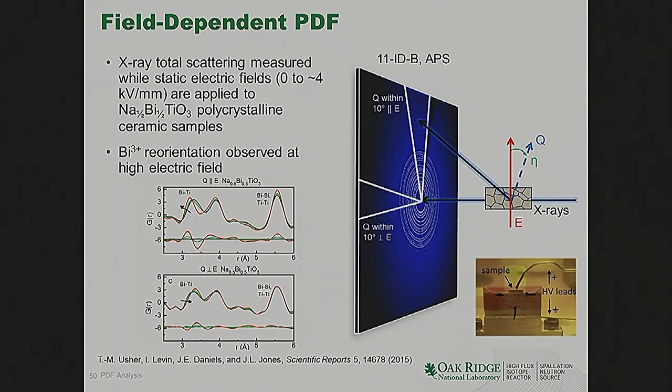Another cool area, Teddy Marie is actually a postdoc working with me now, but in her PhD work with Jacob Jones at North Carolina State University, they had looked into doing field-dependent pair distribution function studies. So applying a field and actually breaking this requirement of powder diffraction that you have isotropic scattering everywhere, looking at the local effects of applying field. And anyway, there's this paper, and now there's several others from that group exploring that idea.